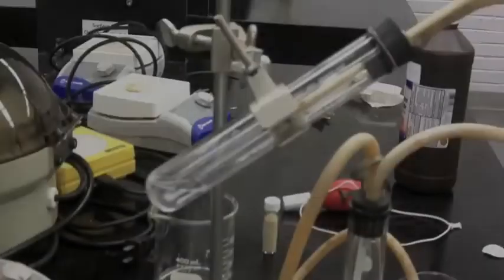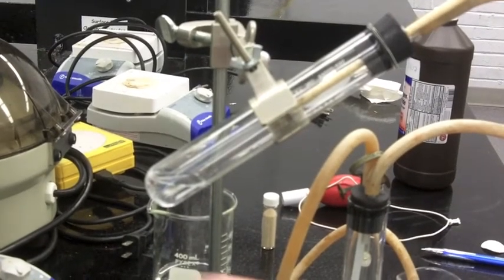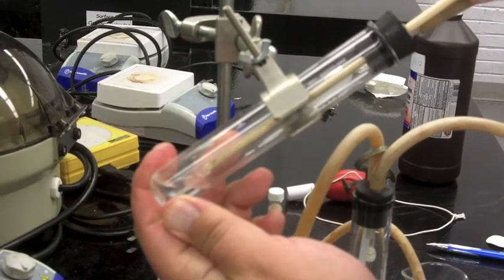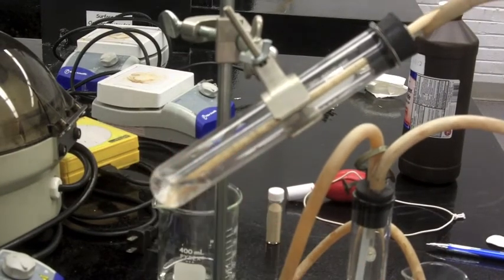Okay, so now this part is set up pretty well, and we have a closed system now from the gas collection. So now we can open up the clamp, and they're not leaking, and we should be ready to go. When we're ready to do the experiment, we switch to a dry beaker, one that doesn't have any water in it, and we stick the yeast in.